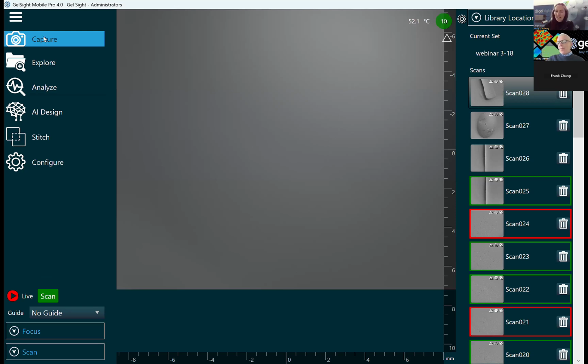So we're looking at a field of view of about 14 by 17 millimeters with the Series 2 system. And really large curvatures or really large radii might look flat to our system. So even though defect detection is really for flat surfaces, we can still use it on curved surfaces if the radius is large enough.